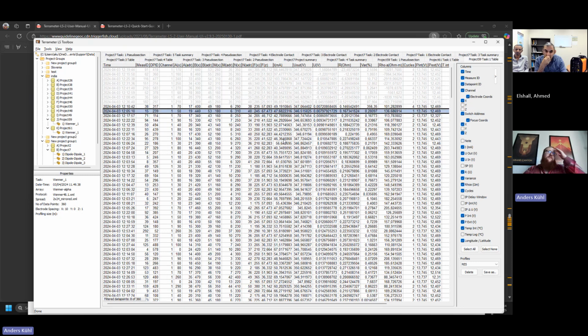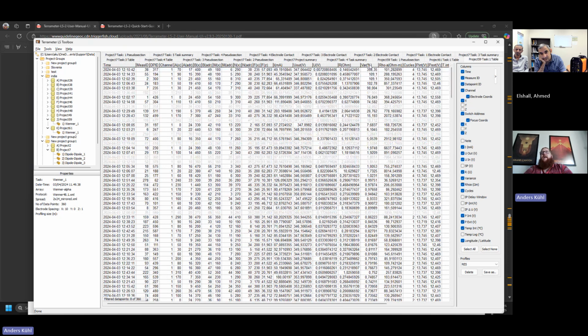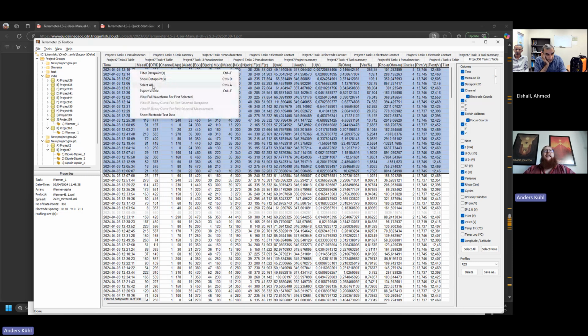So this toolbox is a way to do some initial quality processing. You can look at the noise, that's a variation percentage. Let's say our noise floor is 1.5%. Then we can take all of the values with a noise above that and filter them.